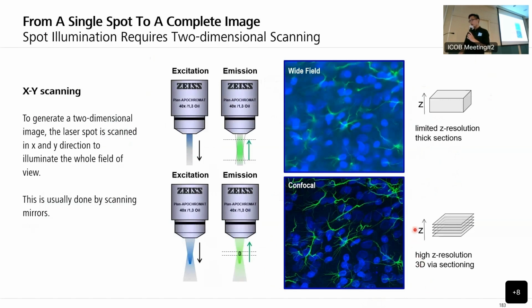Then we do the Z-stack imaging. So we take multiple images at the Z-stack, but every stack has in focus signals. Then we can project or do the 3D reconstruction to gain the whole data set without out of focus structure.